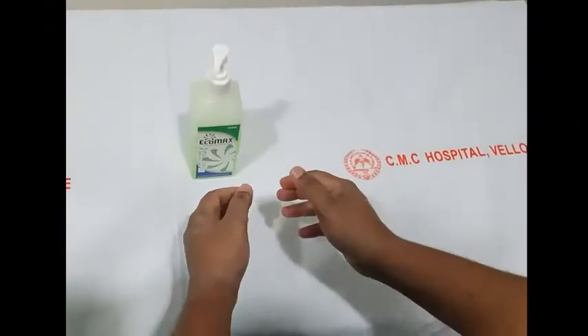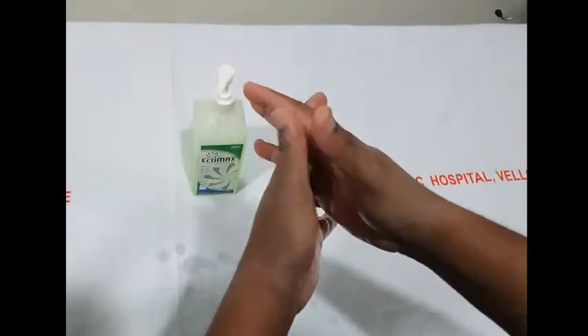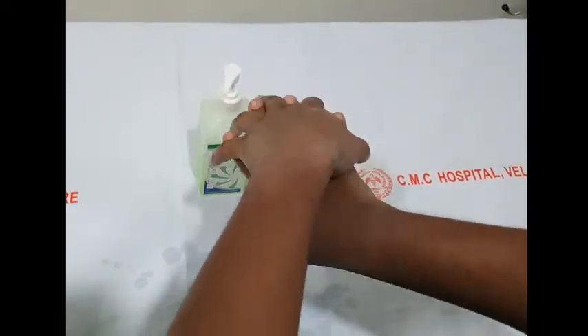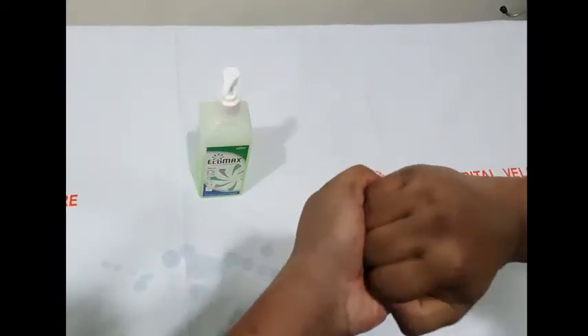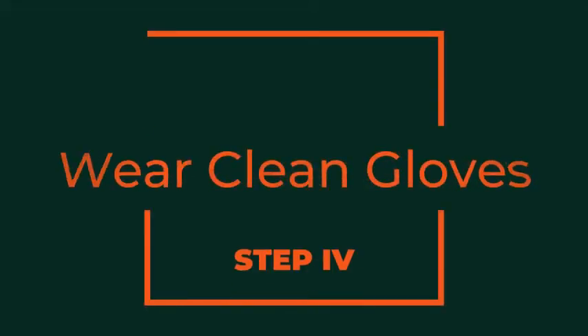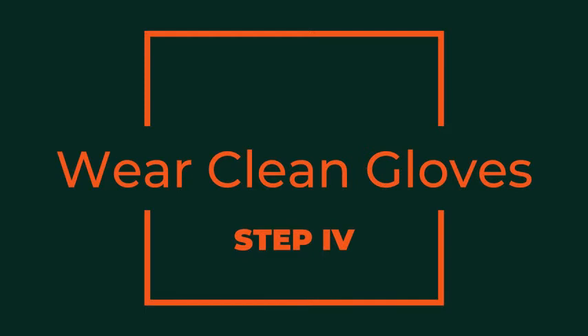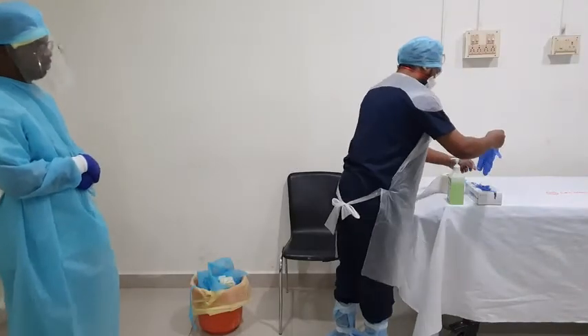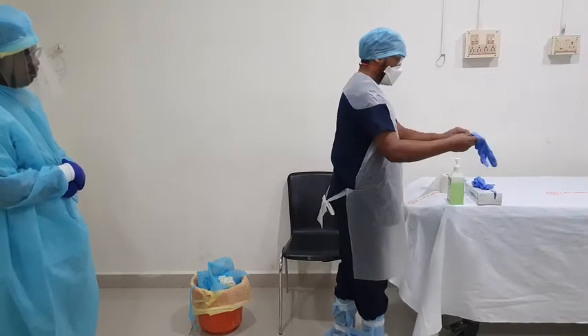If your hands get contaminated during this step, immediately use an alcohol-based hand sanitizer. After removing the first pair of gloves, wear a new pair of clean gloves.